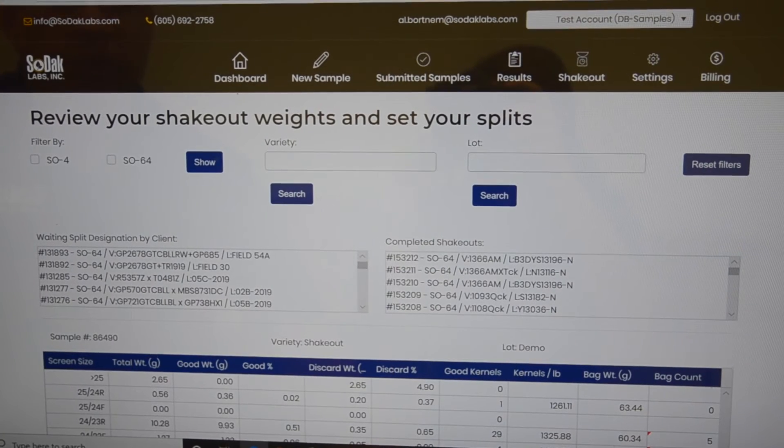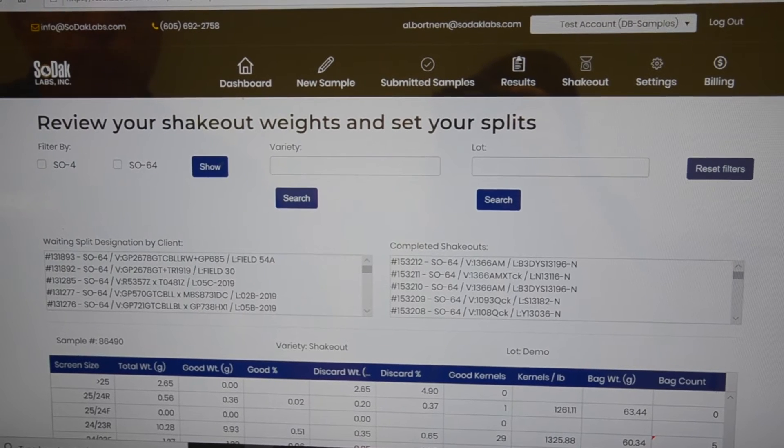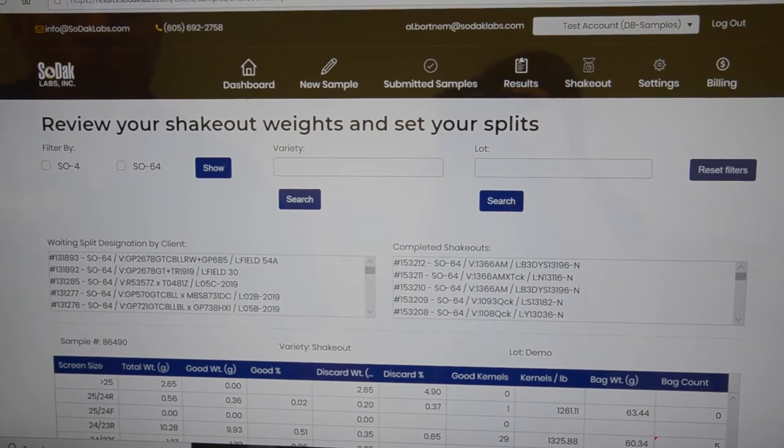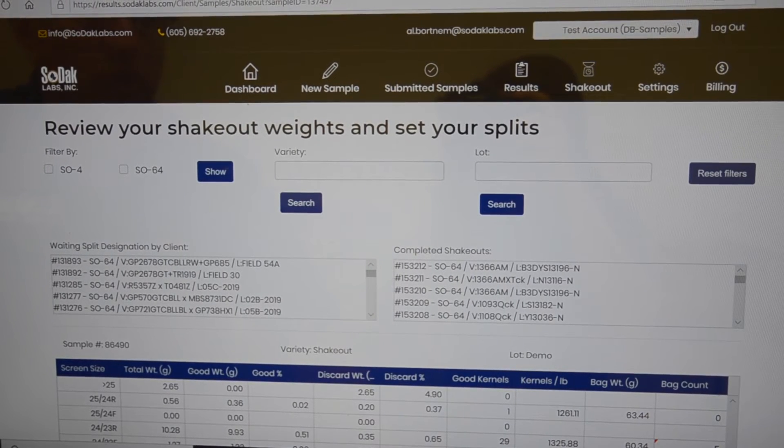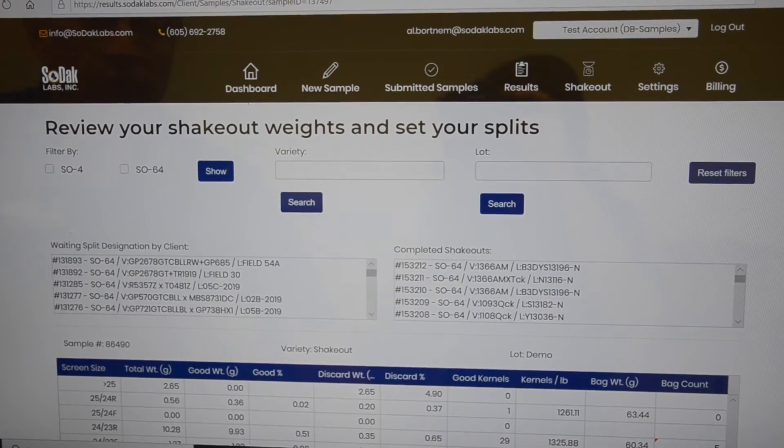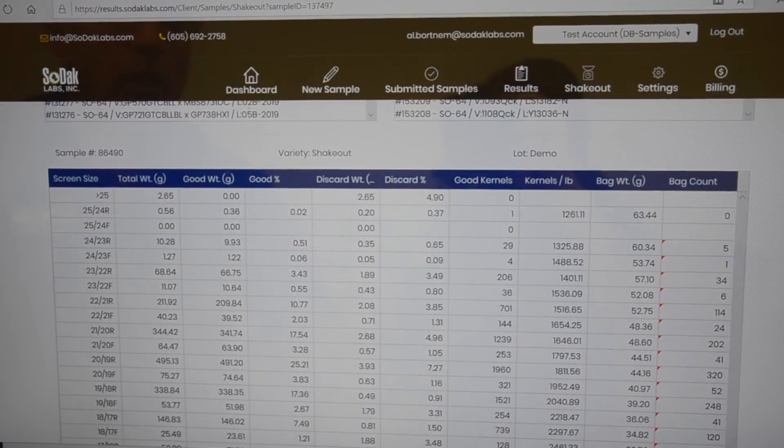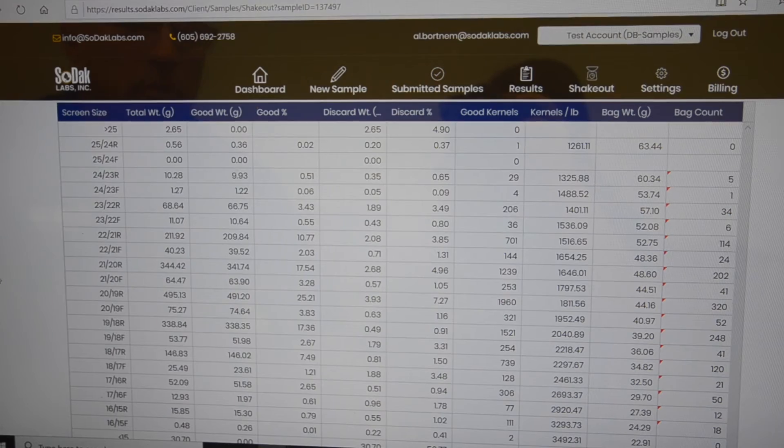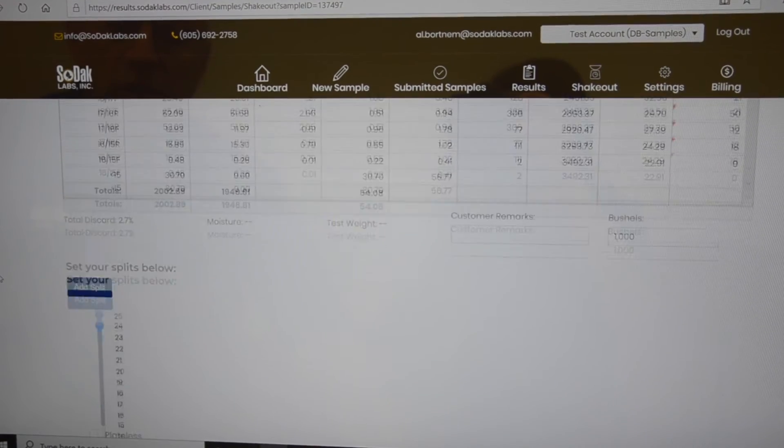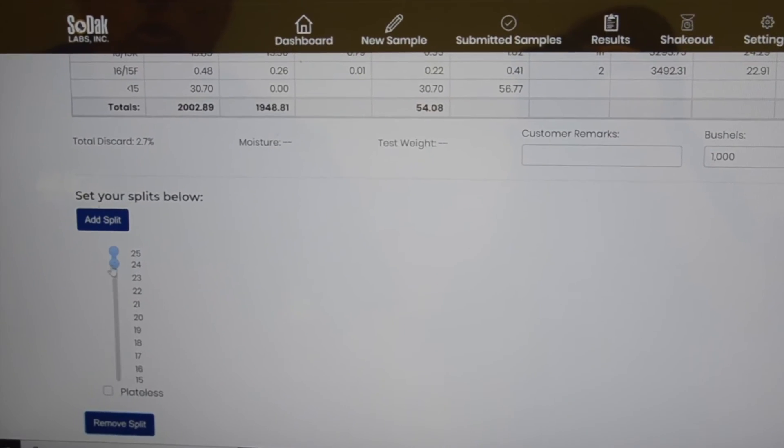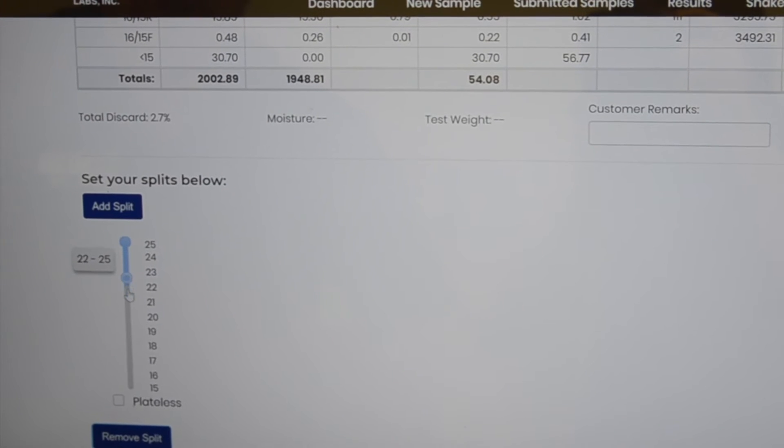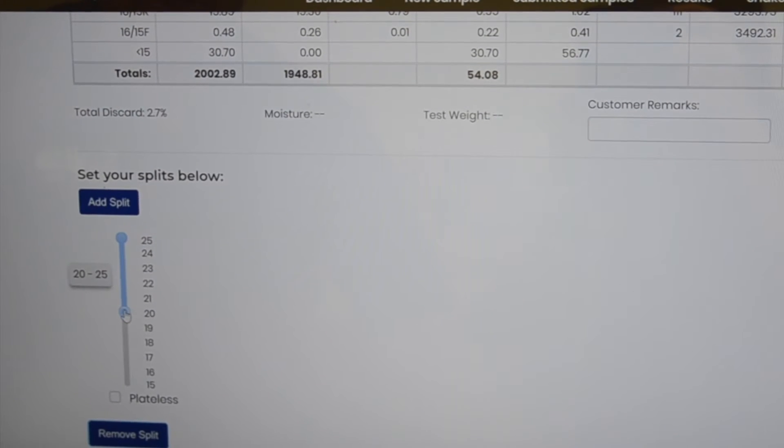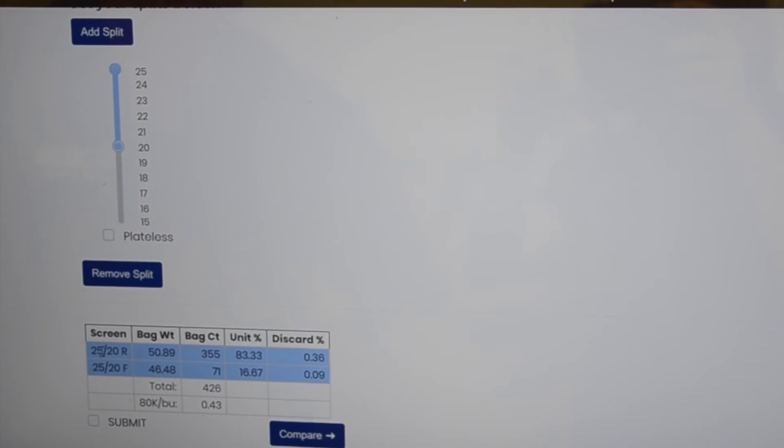Once we've completed entering all the information, we hit done. That sends it to your account where you can review it. It would come up here on your SODAC account with all the information, and then at this point you would add your splits or the screen sizes that you think you'd be using.